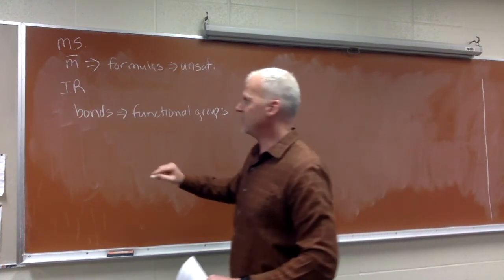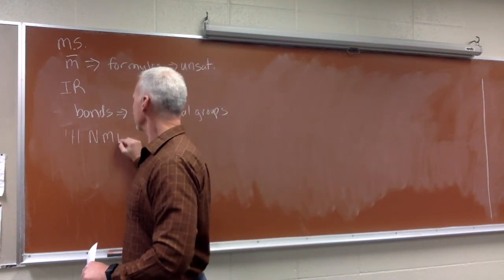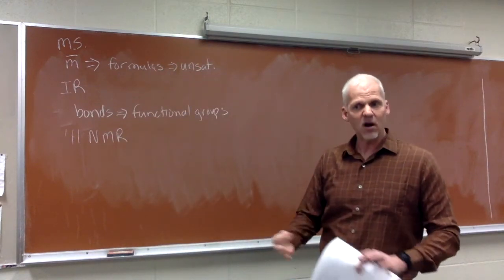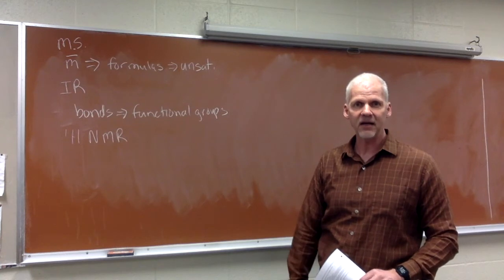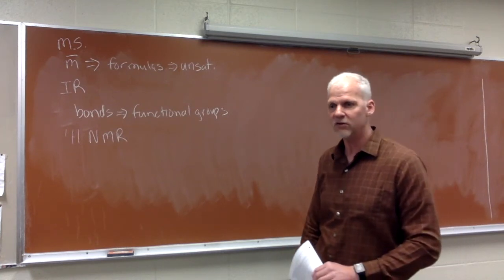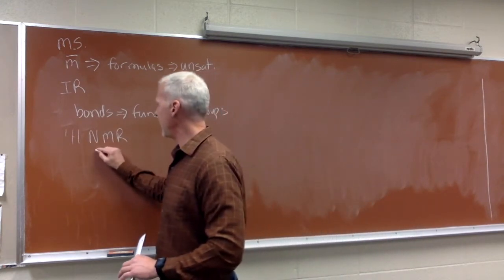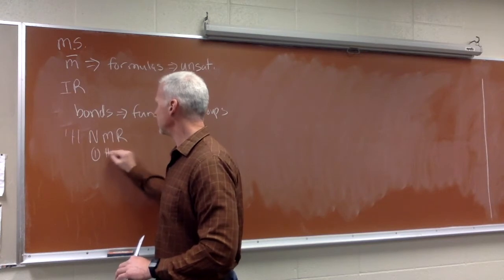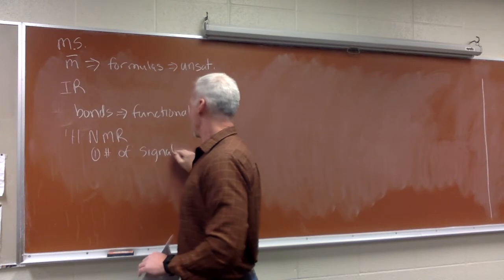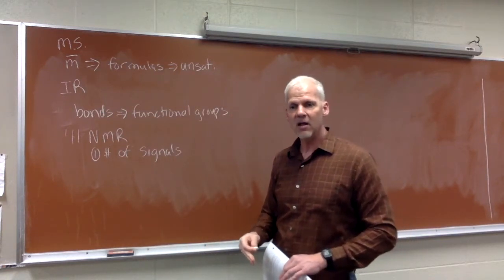And then a couple weeks ago, we talked about proton NMR spectroscopy. And that was a technique that we saw informed us as to the carbon-carbon and carbon-hydrogen bond connectivity in a molecule, and certainly that's powerful information if you're trying to solve that structure. If you recall, we got 4 types of information from that NMR. The first was the number of signals. And that correlated with the number of different types of hydrogen within the molecule.